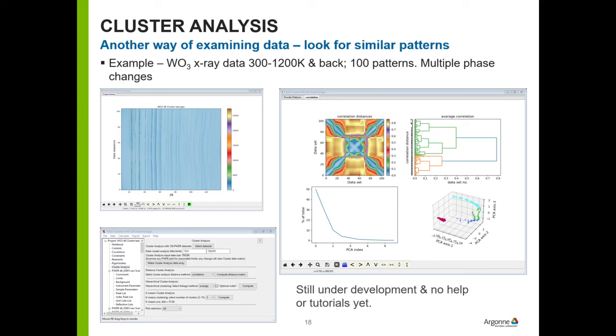And you can almost see in this particular figure where the phase changes are. There's one about there. There's one here. Actually, two of them in there. There's another one right about there. And then you're back up to high temperature, and it goes back the same way in the other direction.